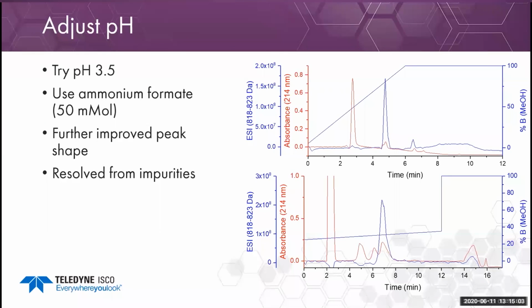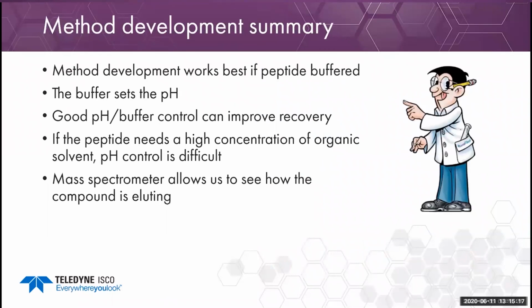These buffers, being volatile, can also be removed during lyophilization, making cleanup post-purification much easier than mineral salts. In preparative LC, removing salts or other modifiers always needs to be considered.